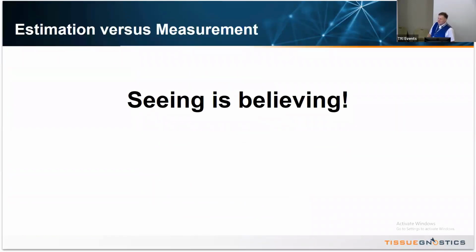Why is quantification important also in microscopy? I don't need to explain why quantification is necessary in general, but for many years, microscopy has just been used as a means to get nice images. When I think back at the time of my PhD in the 1990s in Vienna, I was an operator of a Zeiss confocal microscope there, and many times researchers, even from other departments, came to me after they had practically finished their manuscript.